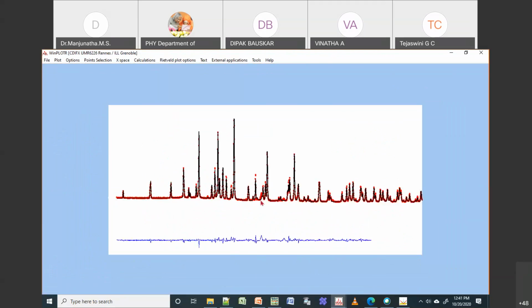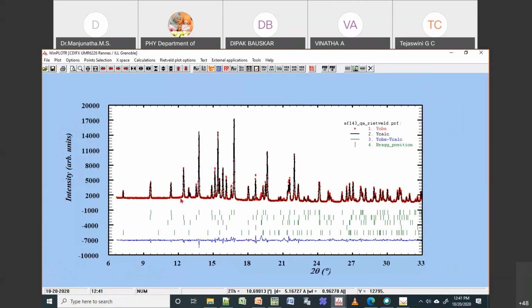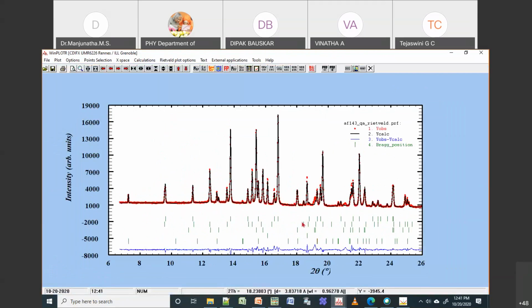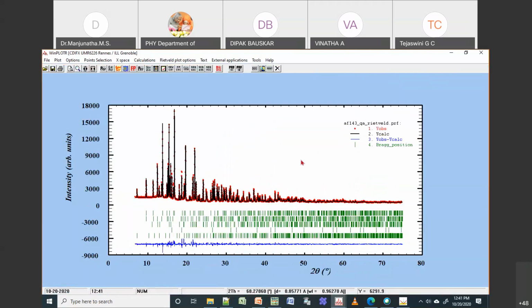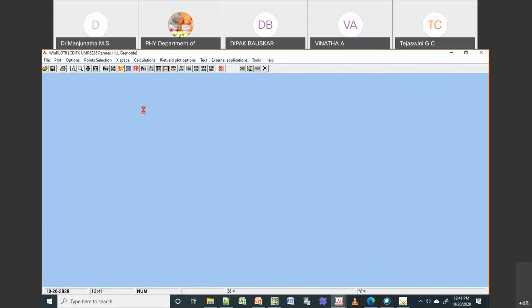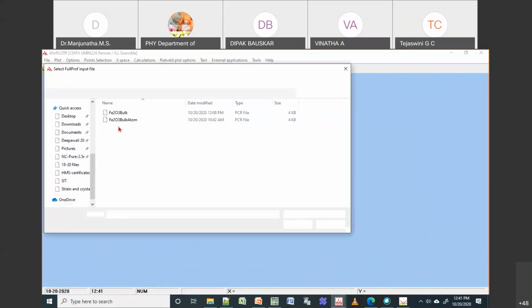So this is very challenging, because I cannot show it in just 30 minutes or 1 hour. Okay, so it needs a lot of patience to do it one by one. So maybe I will show one with some other sample with 2 or 3 phases, but you can do it also for 5 phases. Okay, so this is the fitting I did for this sample. I can run it one time if you want.